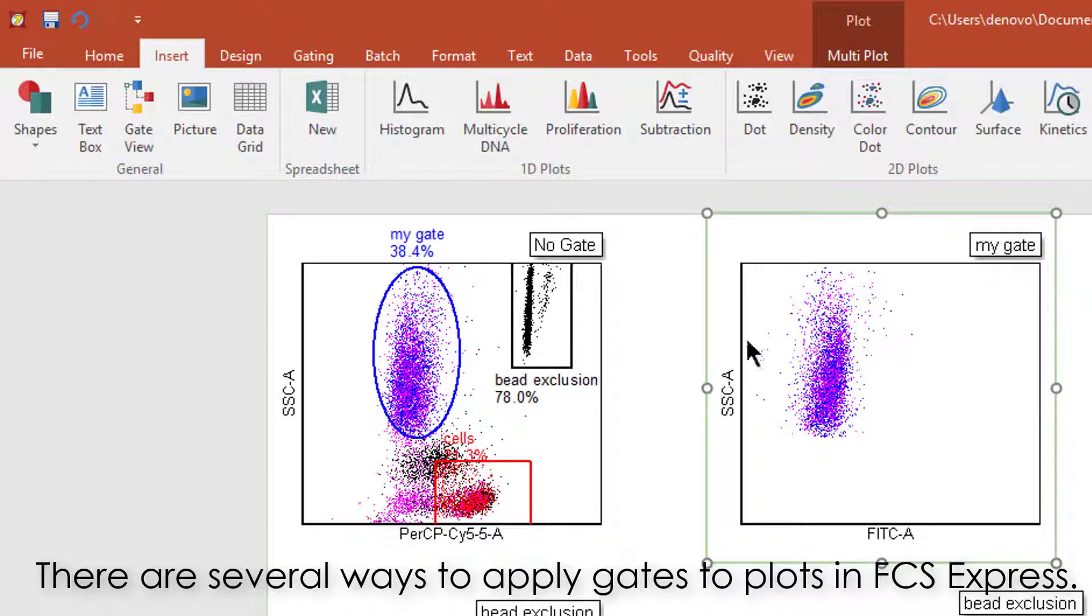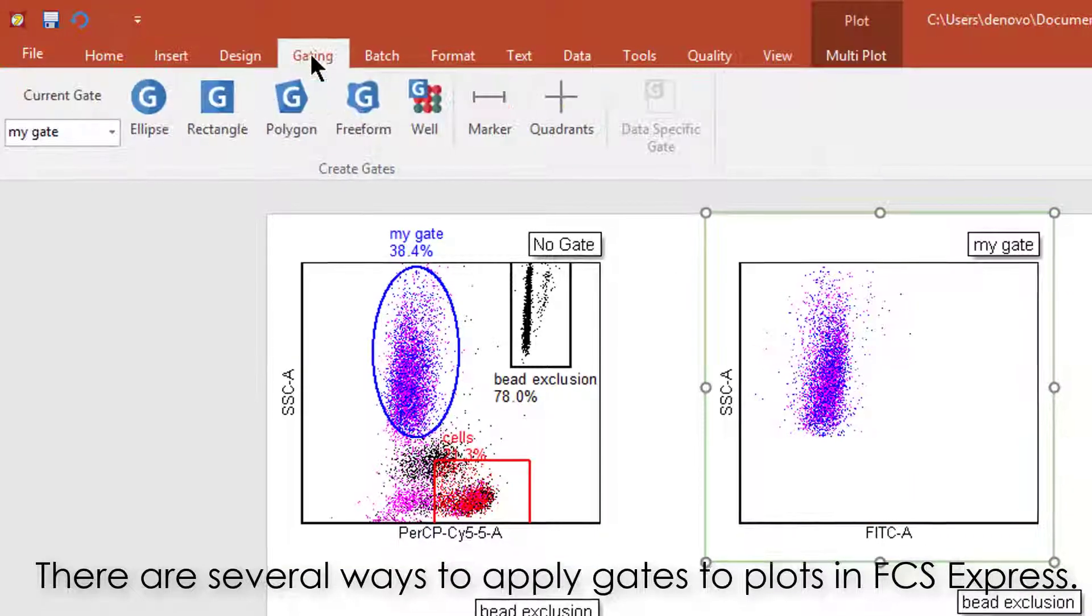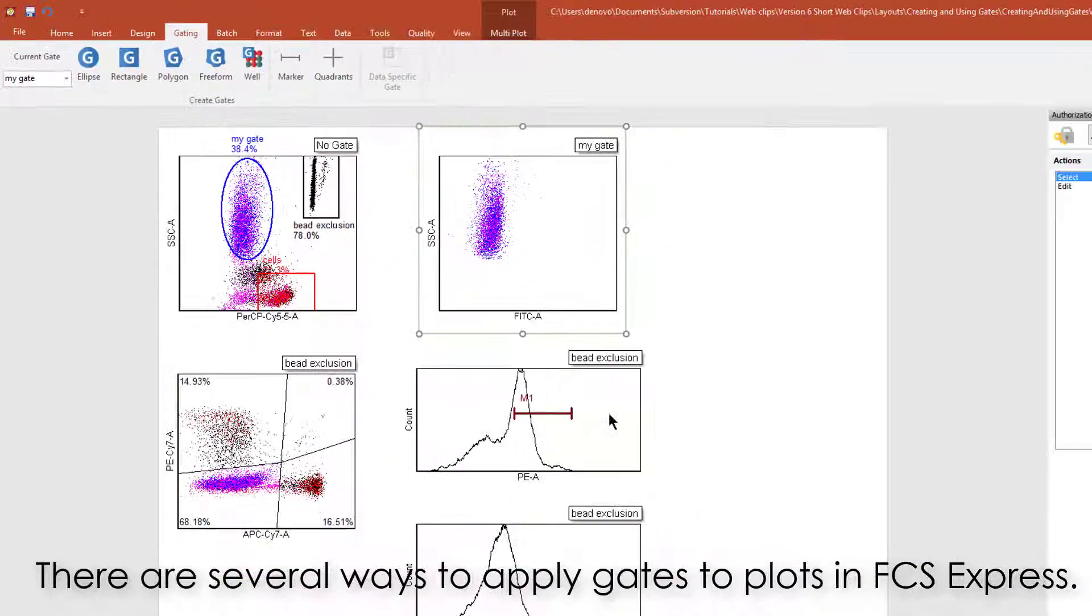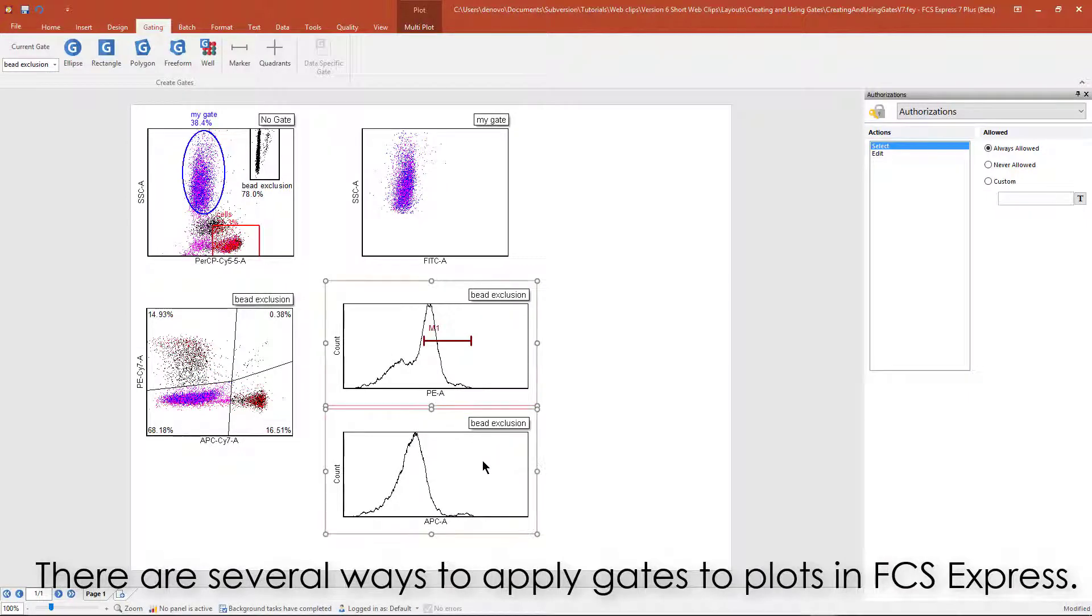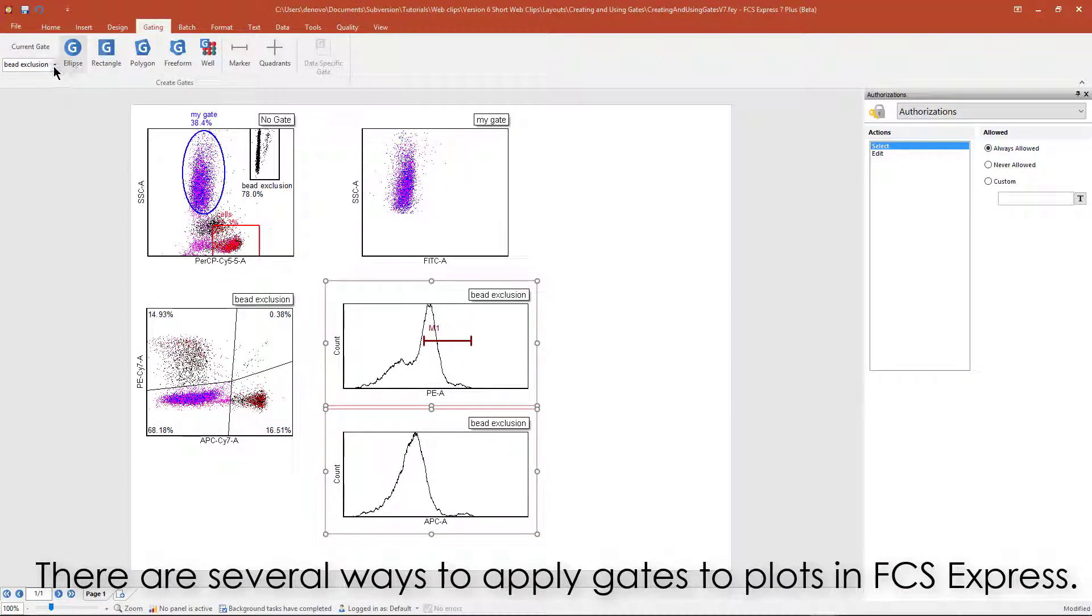Another is to use the Gating tab on the ribbon. This is especially helpful when you want to apply a gate to two or more plots simultaneously.